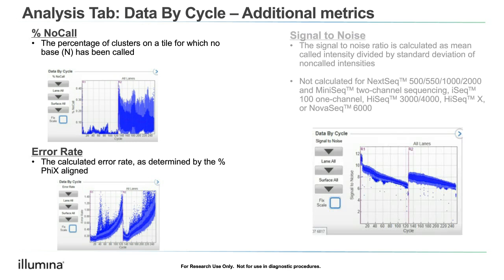The signal-to-noise graph, which plots the signal to background in the cluster images, can give us information on the quality of the clusters or the imaging of the clusters. These values are generally between 8 to 12.